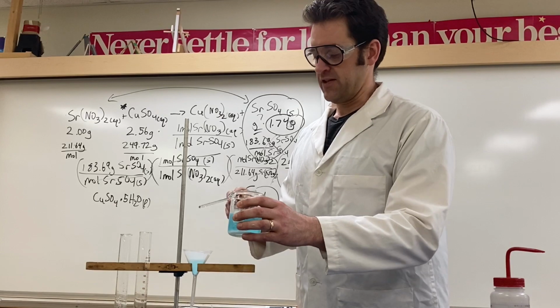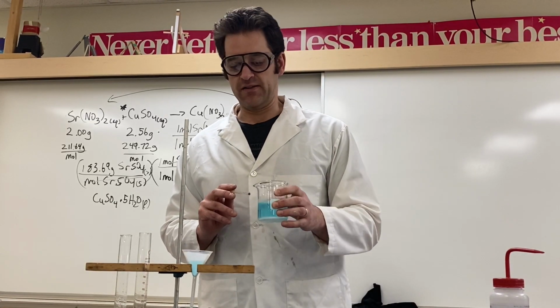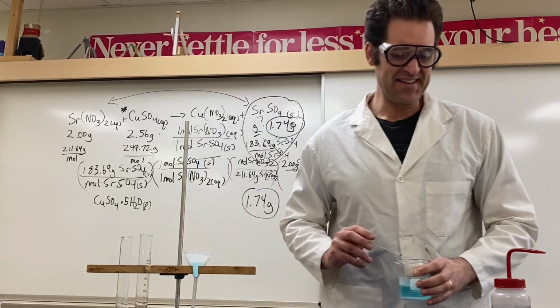So we're going to do some magic and go right to the end, where all of this has been poured in the filter, and it's filtered all the way through, and dried overnight, because that's another 45 minutes of work, right? 6.5 hours later.